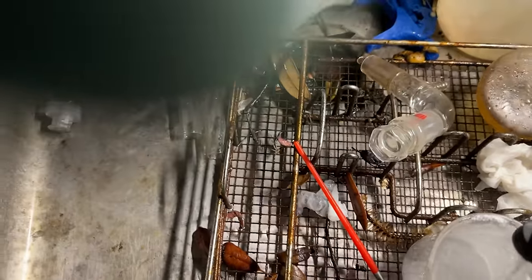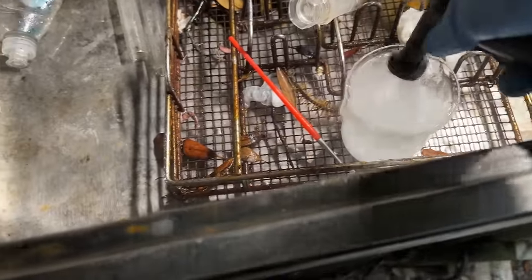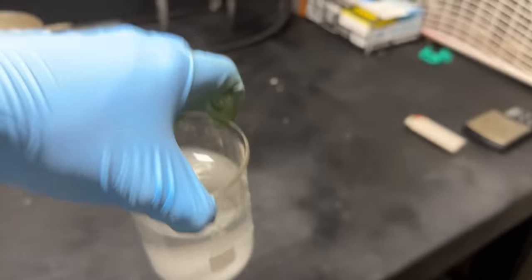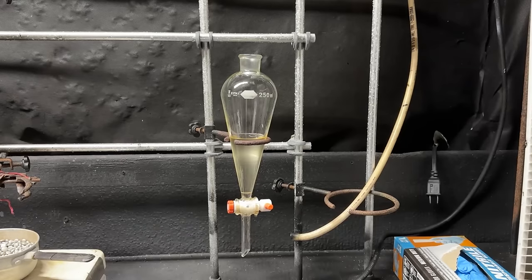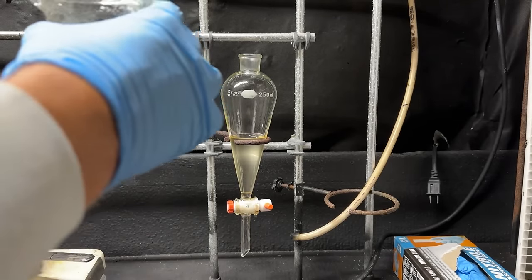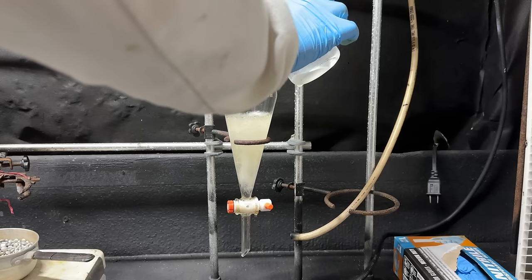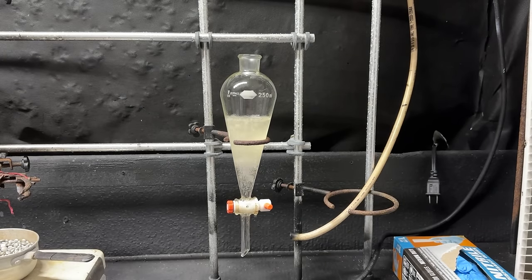Walking over to the sink to add water. I should have used distilled water — whatever, too late. Now I'm going to pour some of our baking soda solution into the separatory funnel. As you can see there's definitely still some acetic and sulfuric acid because it's neutralizing pretty noticeably.